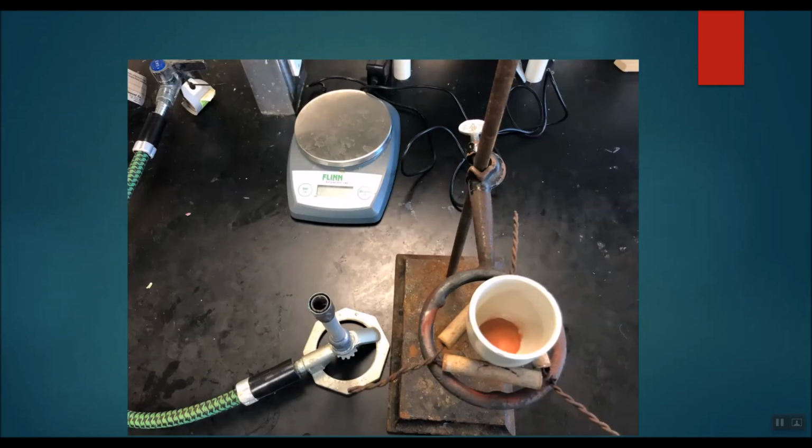Here are the tools that we're going to be using. We're going to be using a Bunsen burner and a clay triangle. You can see there, you finally get to use a clay triangle with this experiment. And you have the crucible with the copper, and you will also have a ring stand.